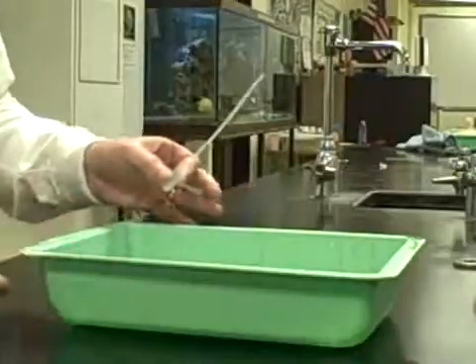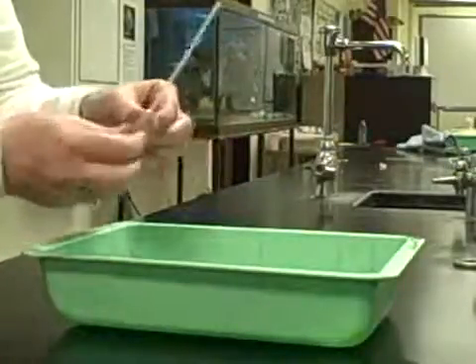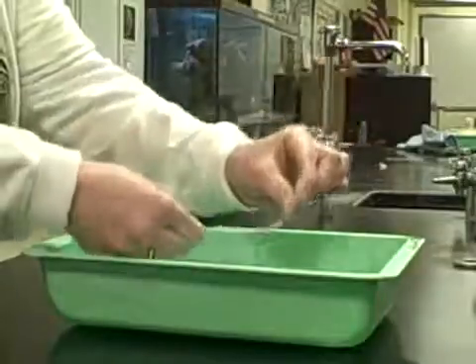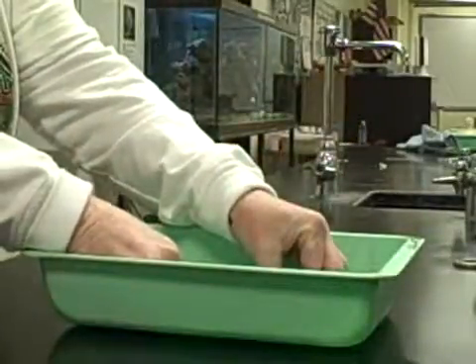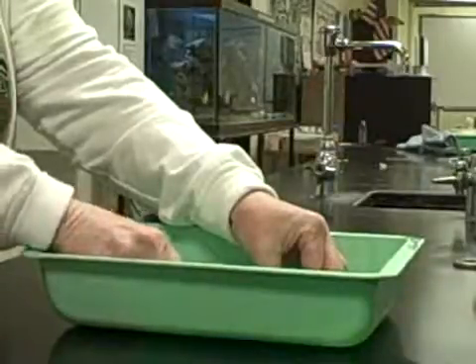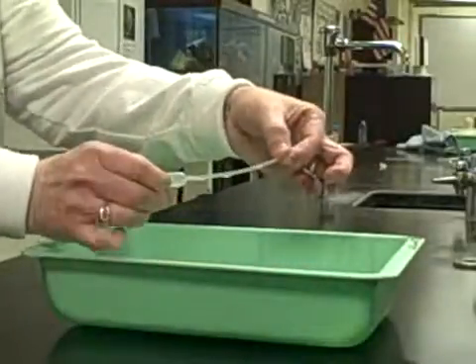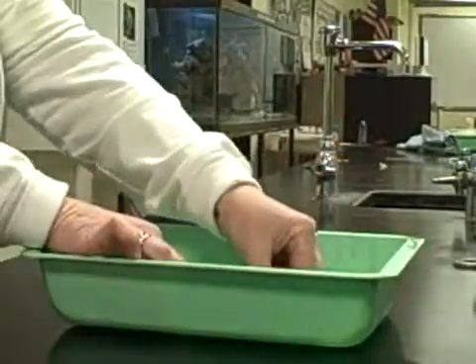I'll have some green baskets around the lab stations. If you take your pipette, the trick is to squeeze the bulb as flat as you can between 2 fingers, and then just bend the tip a little bit, and when you submerge it into the water, you want the tip just below, and then the bulb should fill up with water. The little bit of air you have in there, you can just squeeze, and if you squeeze slightly on the bulb, that air will go out, and then water should be drawn back inside.